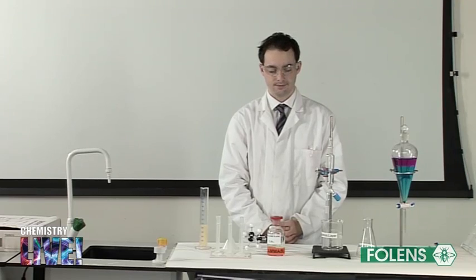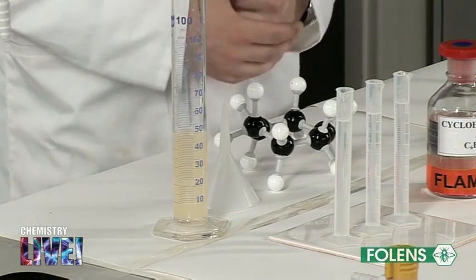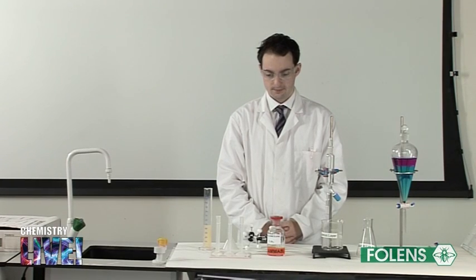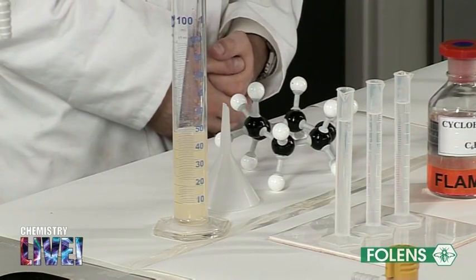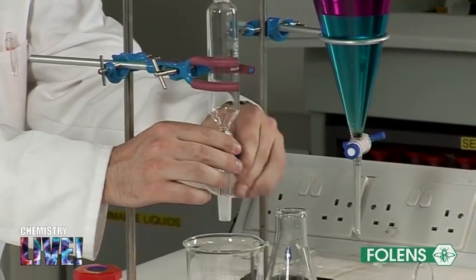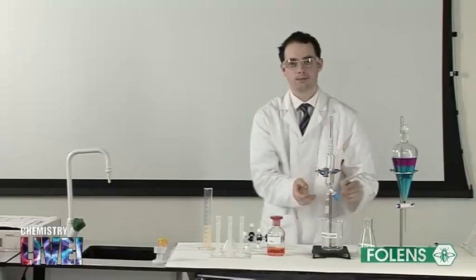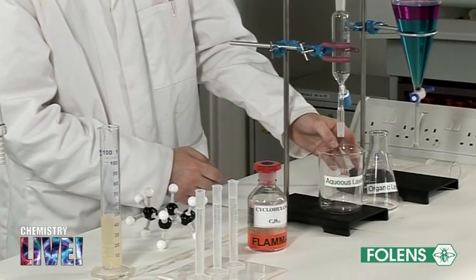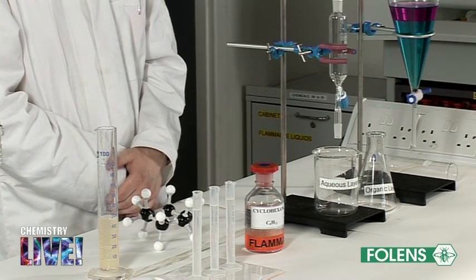We need to start with about 50 cm³ of emulsion in order to isolate a small quantity of the clove oil. The oil from the emulsion will be extracted 3 times during the experiment using 10 cm³ portions of cyclohexane. Check that the top of the separating funnel is closed. When placing the liquid in a separating funnel, a beaker is always placed under the funnel in case the tap is accidentally left open or in case the tap of the funnel is leaking.